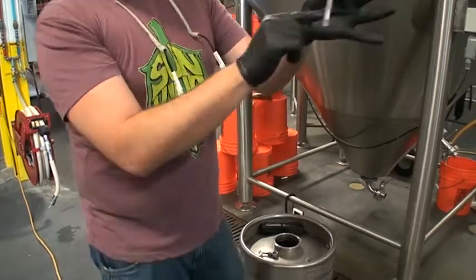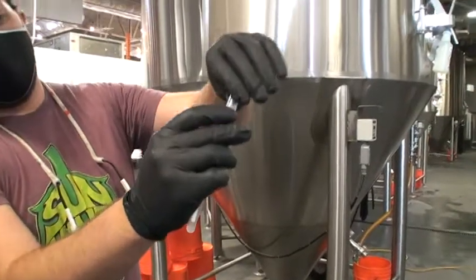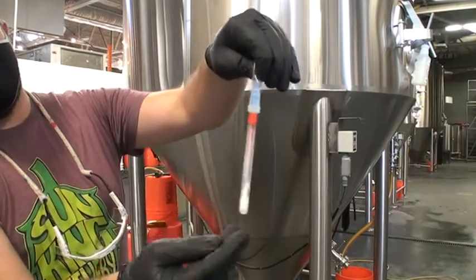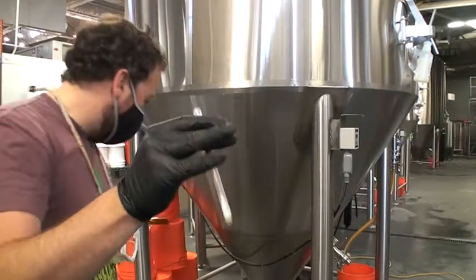We'll seal it off, the tube's down, the swab's down there. Up here, you can see a little bit of liquid. We're going to break the seal. The liquid will squeeze into the bottom of the tube now and react with anything that's on the swab. We'll shake it for 15 seconds.